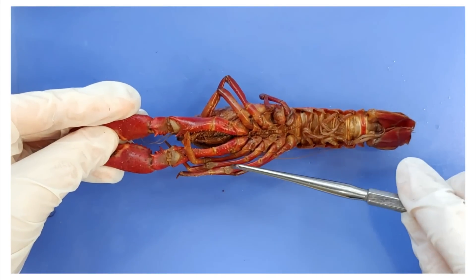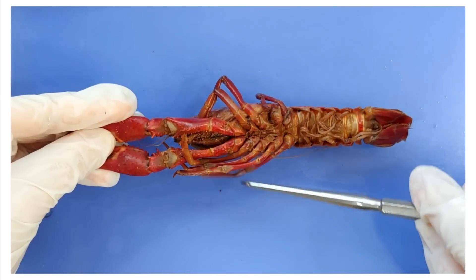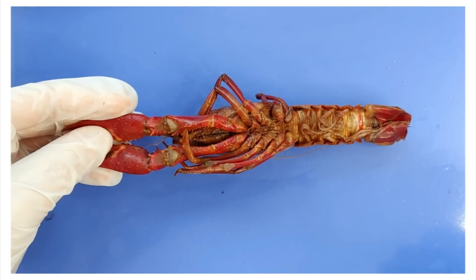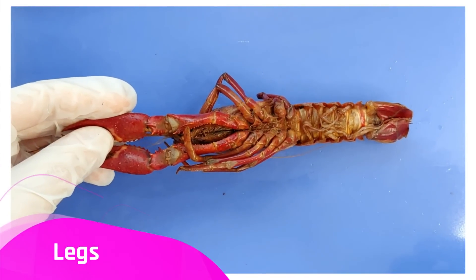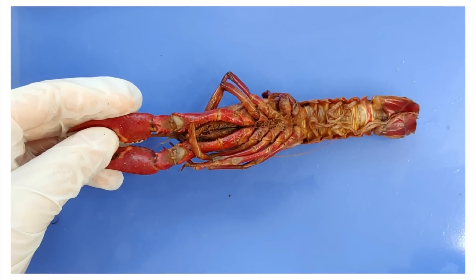These other four pairs — one, two, three, four — and here there's one that's broken but that's okay. These other four pairs have the less glamorous but still important job of locomotion. These legs are used to walk around.